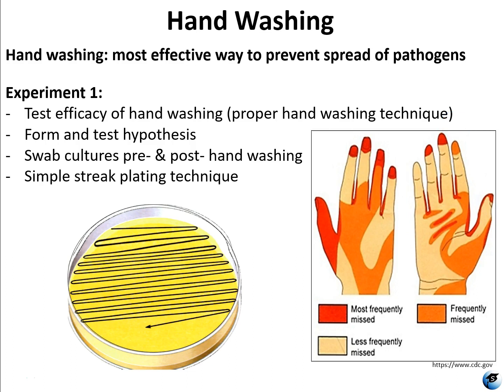You want to do that lathering for approximately 20 seconds. If you're not sure how to estimate 20 seconds, you can sing the happy birthday song twice — that's approximately 20 seconds. Then finally, you rinse the hands again and dry with paper towels. Paper towels are cleaner than air blow dryers, because those are actually blowing more bacteria onto your hands.